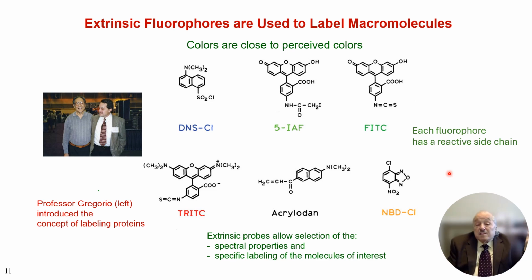it fluorescent by adding a fluorescent group that reacted with the protein in some way, typically with amino groups on the surfaces. So instead of just having to deal with the deep UV fluorescence that comes from proteins, you could put a fluorescein type molecule on it, a rhodamine type molecule on it, or any variety of molecules, and these all have reactive side chains.